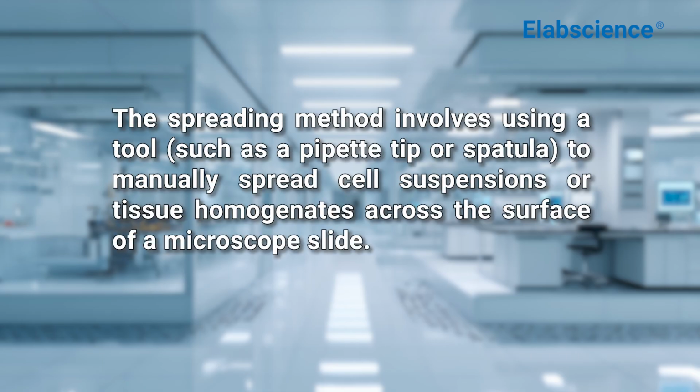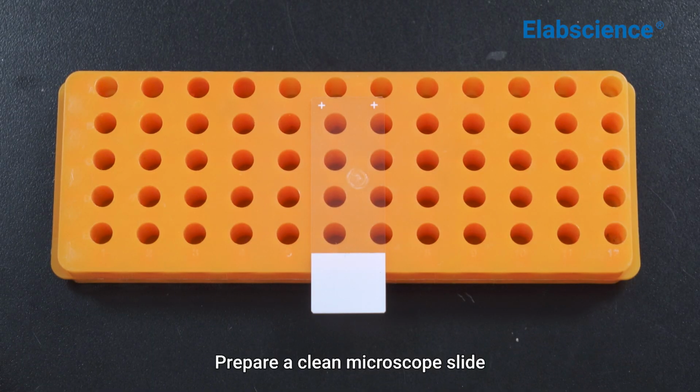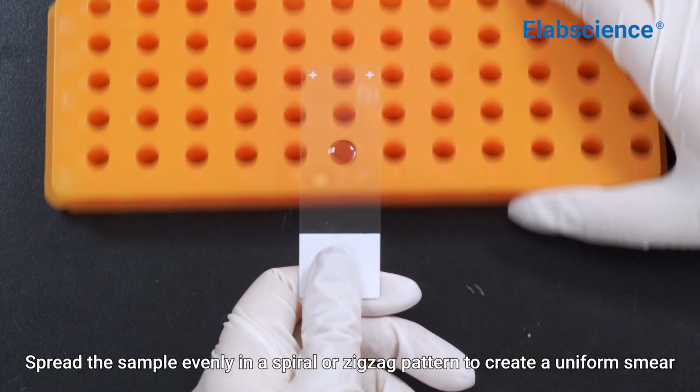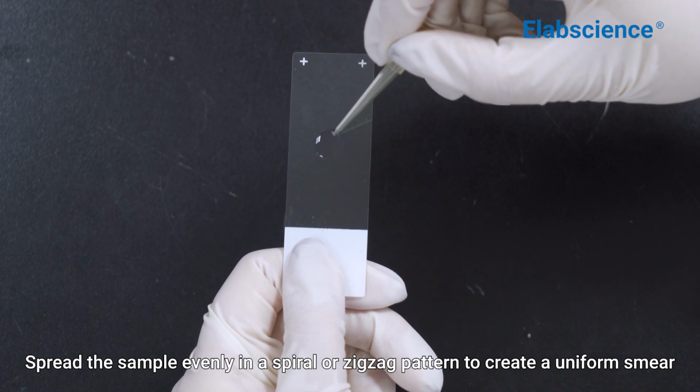Spreading method. Prepare a clean microscope slide. Use a pipette to apply the sample onto the slide. Spread the sample evenly in a spiral or zigzag pattern to create a uniform smear.